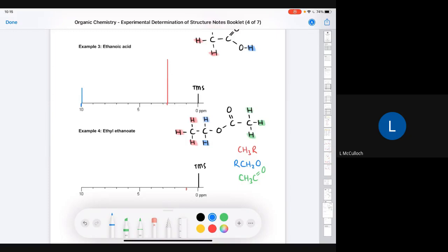For the blue hydrogens, we're looking for an R to a CH2 and an O. And if you look at the 4th entry down, you'll see RCH2O, and that's between 3.5 and 3.9. So I'll pop my little blue marker in there.